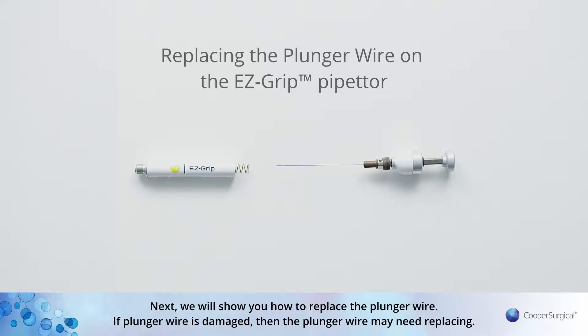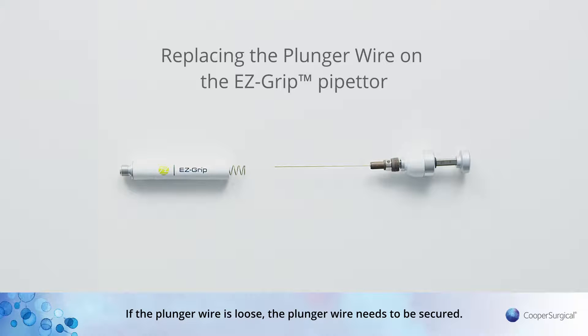Next, we will show you how to replace the plunger wire. If the plunger wire is damaged, then the plunger wire may need replacing. If the plunger wire is loose, the plunger wire needs to be secured.